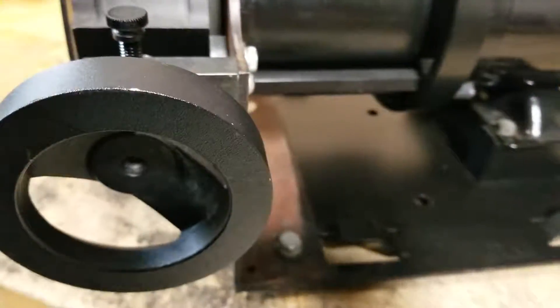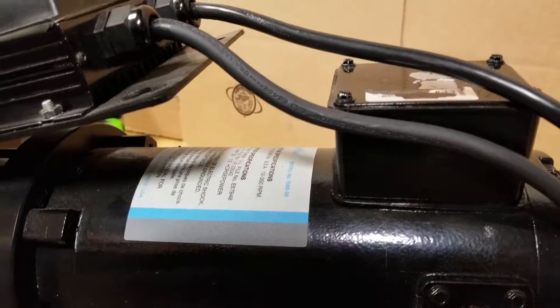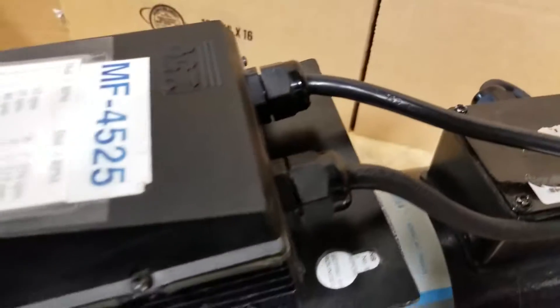This is in very nice condition. It's got a — how much does it weigh? 80 pounds. Is that the shipping weight? Yes, 80 pound shipping weight.